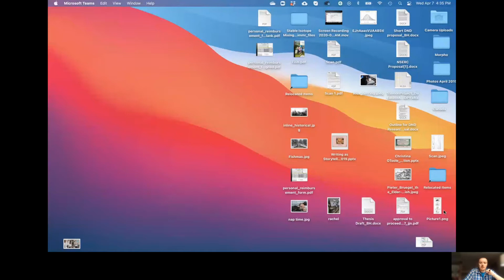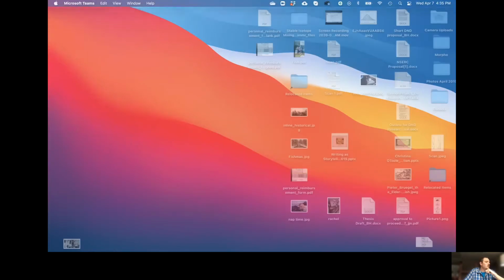We're just going to run with our same worked example, and I'm going to run you through some scripts and show you how it works. We'll look at some of the outputs from that and figure out what it all means. So I'm going to start sharing my screen here, and I'm going to share this entire screen, and then you all should be able to see what I need you to see.